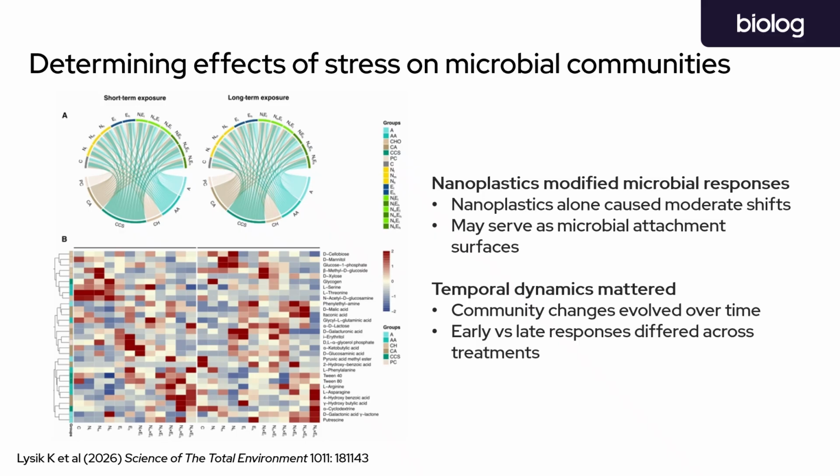And another key insight here is that the community response is actually evolving over time. So early responses may differ substantially from later ones. And this is in line with what we've seen in EcoPlates, right? So this reinforces the importance of actually collecting kinetic measurements and time series data for your assays.